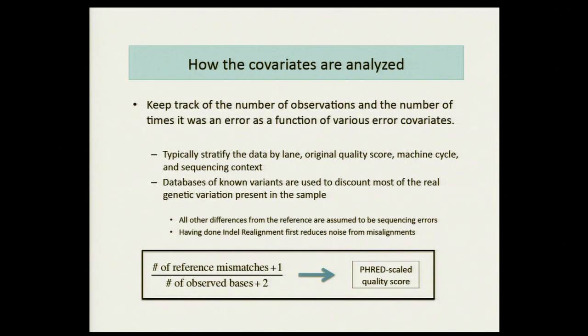A little bit. Do you account for interactions among the covariates? Okay, so no, it doesn't at all. So the question is, you make this independence assumption, is that a problem? So what we have here is the covariates that we're using, we've done lots and lots of testing to convince ourselves that it's mostly independent, so it's not a big deal.